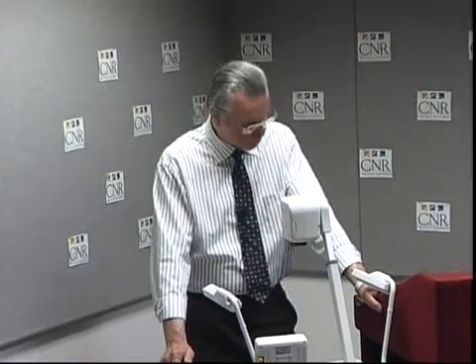TAPPI has issued a new standard, the 563, which is an automated way of using image analysis to do the same thing that for 60 some odd years was reported subjectively, a highly variable measurement which very few people had confidence in, but was used and the numbers were reported. In any case, we've automated it and made it a more objective measurement. With this new methodology that was recorded in TAPPI 563, there came these cards.